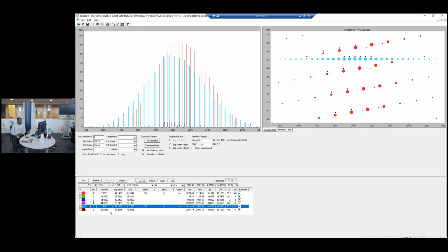It depends. Normally, using the sample prep methods that I've shown, there shouldn't be any issue in the ion source. But there are some requirements that we have to abide by, especially for insoluble samples or polymer surfaces. It can't be something too thick. For example, you need a sample that's 5.5 millimeters or less in thickness. Anything bigger than that will definitely defocus the laser and damage the instrument.